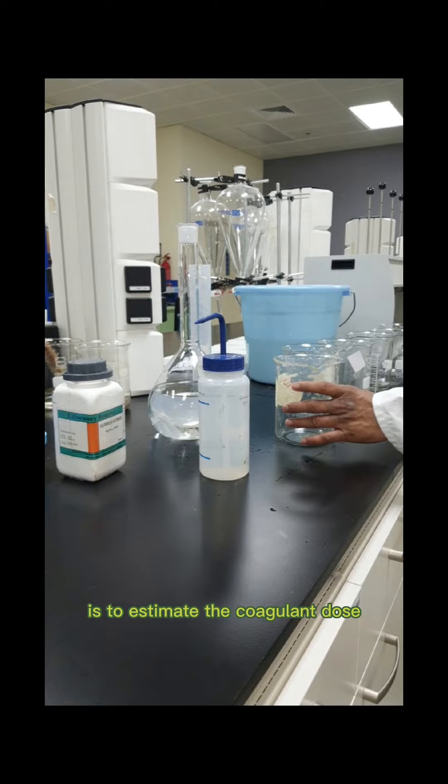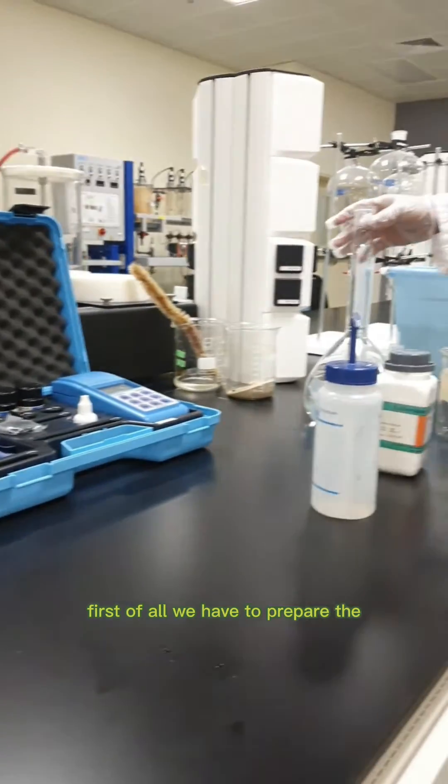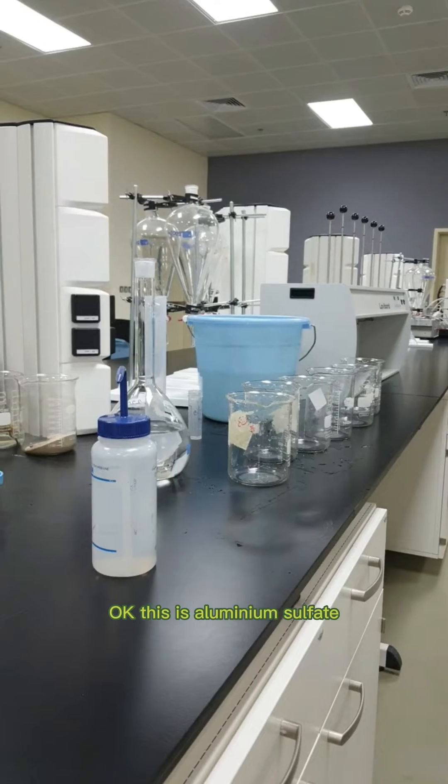For these tests, first of all, we are going to prepare the coagulants in distilled water. We also need glass beakers, jars, and stirring equipment. We need prepared synthetic water, or you can also use water from the treatment plant. The objective of today's experiment is to determine the optimal coagulant dose. This is aluminum sulfate.